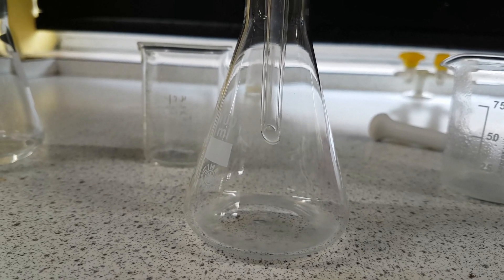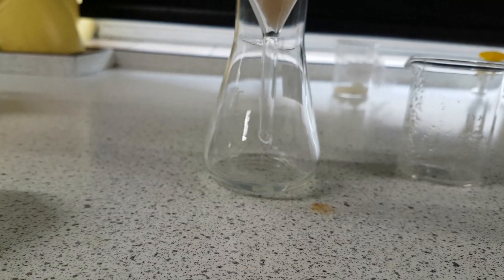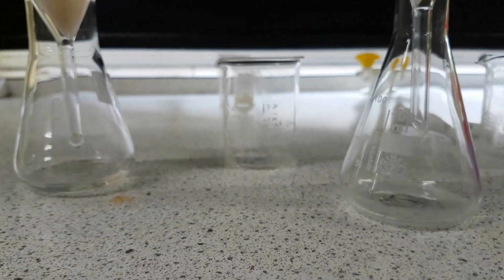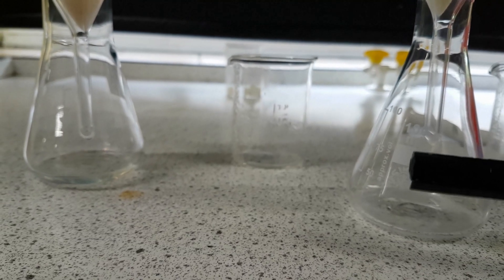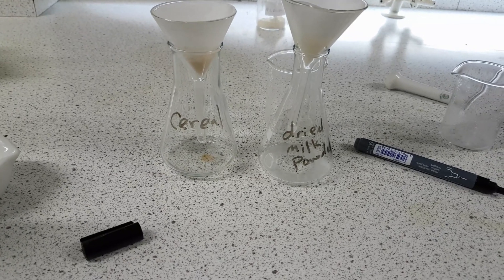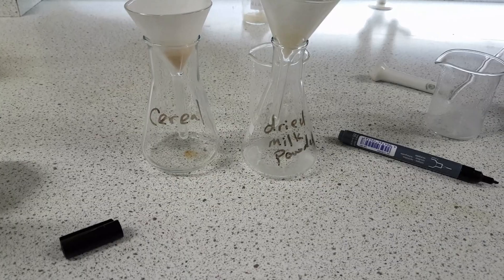So I wanted to show you how to make the solutions first. Next what we're going to look at is how to test for the different things that we are testing for. Just to make sure we don't forget what's what, I'm going to take this board marker and label this with 'cereal' and label this with 'dried milk powder' so I don't forget. So I've labelled them up so that way I don't get them confused.